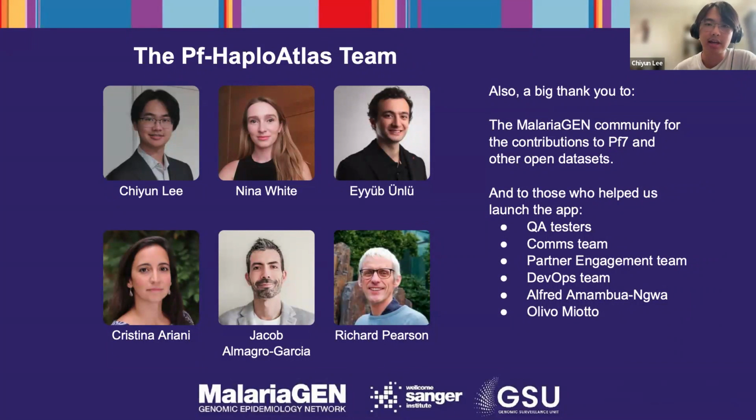Yeah, it's fully free. Anyone can go on there right now and browse all you want. No need to sign up. You just go on and have a browse.